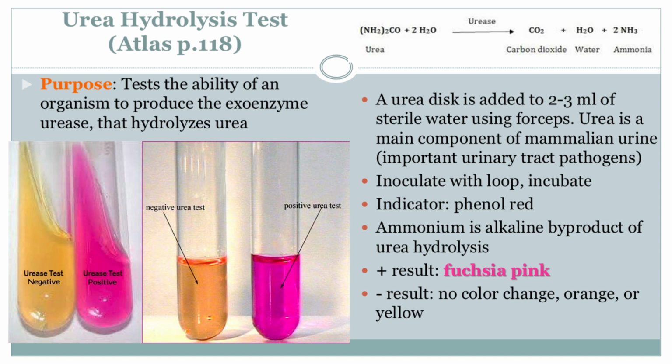Well, not as dramatic as you might think. No bubbling beakers or anything. This test is all about simplicity. We're basically just setting the stage for the bacteria and watching for that color change. So no high-tech equipment needed.